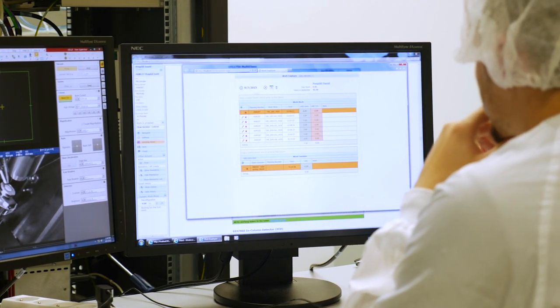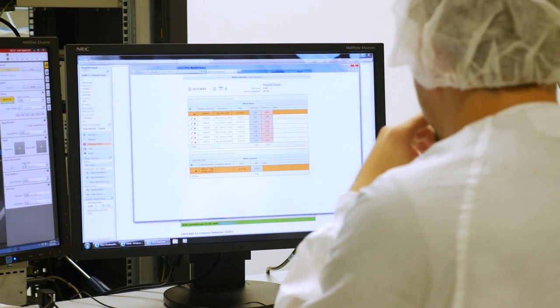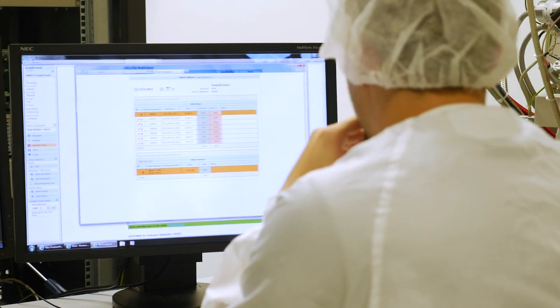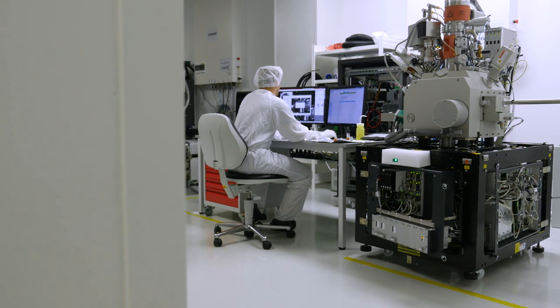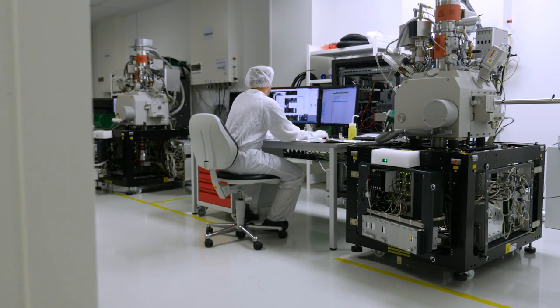The microscope has not been finished yet. Each device has its own birth certificate, a so-called final test, where the entire process of the setup is described in individual instructions, step by step.